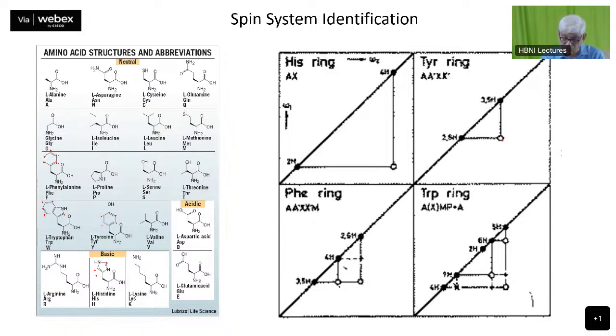These letters are not very clear there, not written in this manner. People will understand it. Therefore, there are some peaks which are weak, and the ones which are very good, they're strong peaks. They're indicated by full circles.